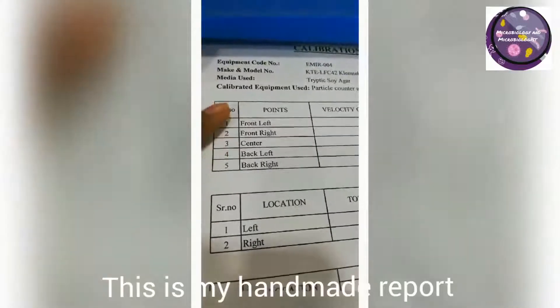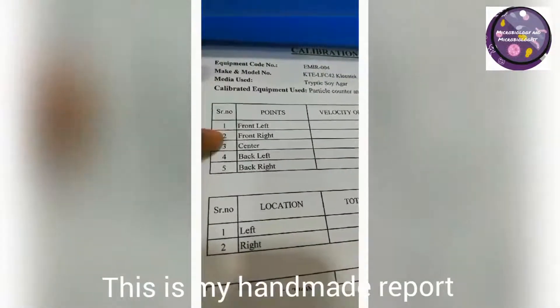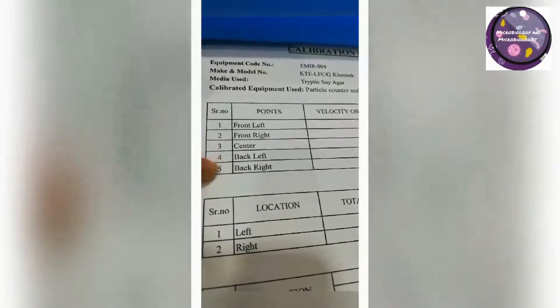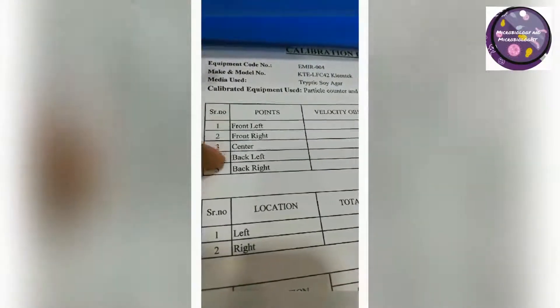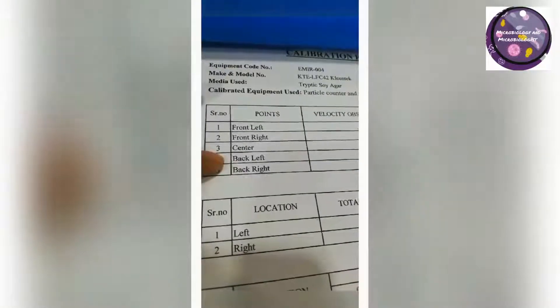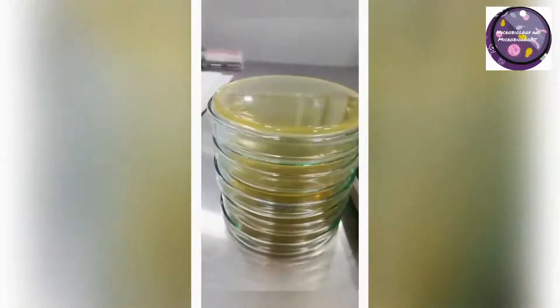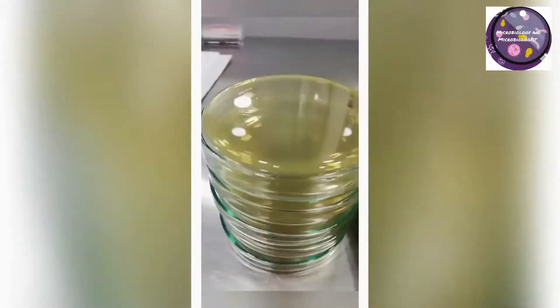This is my handmade report and you can see I have written the measurement points of the laminar airflow hood — those are front left, front right, center, back left, and back right. It has three columns: air velocity count, particle count, and viable count. Let's start our work with viable count.